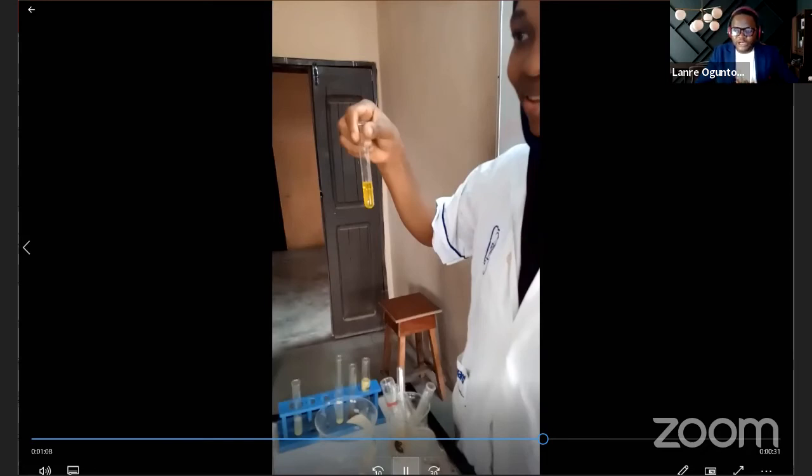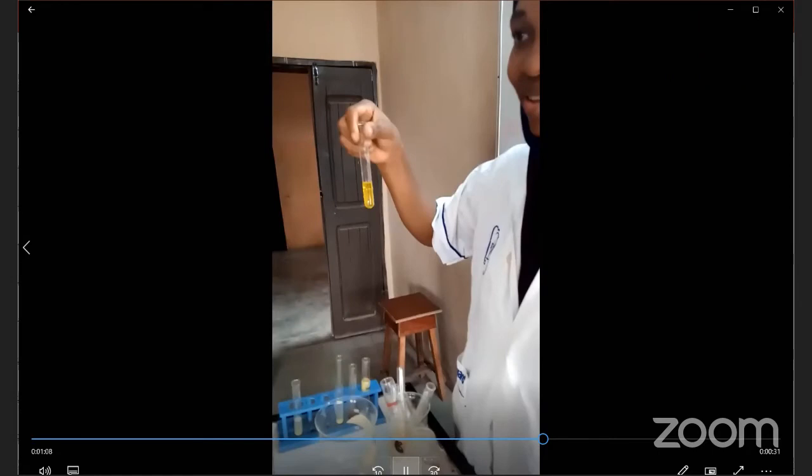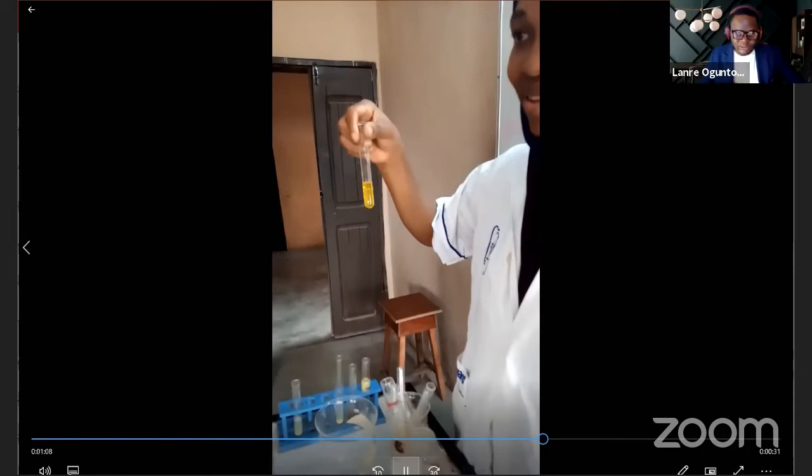So the first thing we looked at was appearance of the two samples. The second thing we look at now is your solubility of your samples. Sorry, my PowerPoint is hanging. Okay. So solubility of the two samples, you would expect that your sample will dissolve in your alcohol. Iodine dissolves better in alcohol than in water.